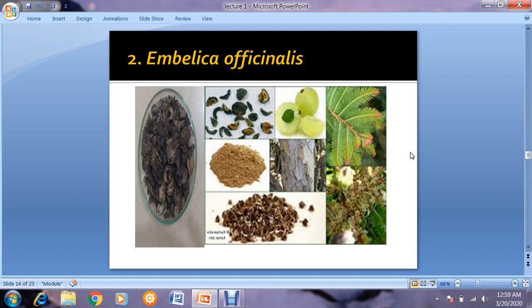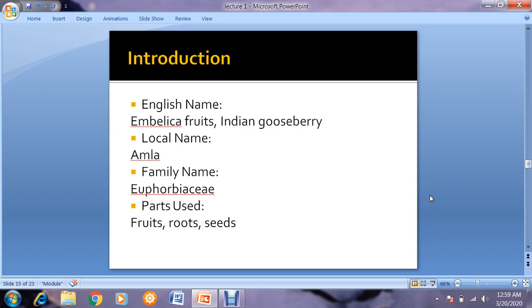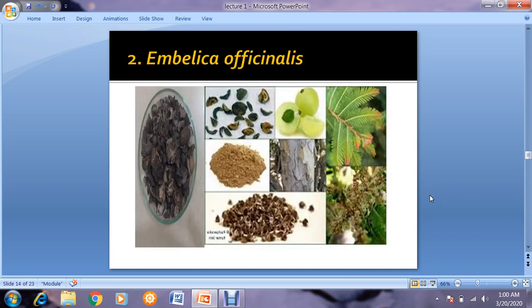Now coming toward the second drug, Emblica officinalis — amla. English name is Emblica fruit or Indian gooseberry, local name is amla, family is Euphorbiaceae, and the parts used are fruits, roots, and seeds. You can see the difference between the fresh form of the fruit and the crude drug form after collection and drying. The shape has changed from its fresh form after being dried.